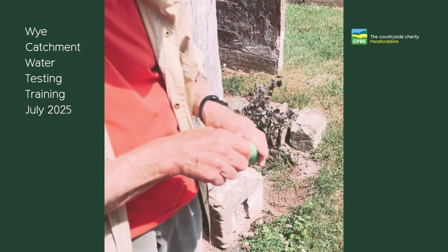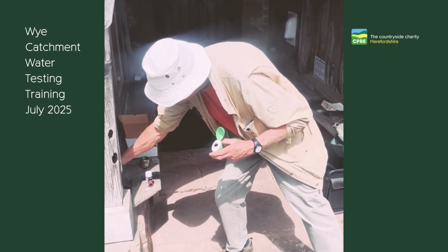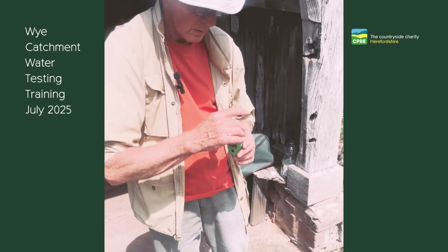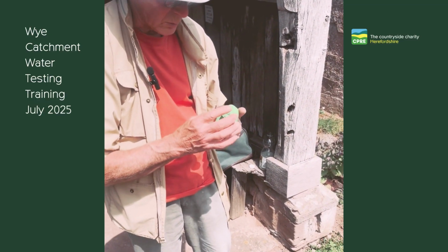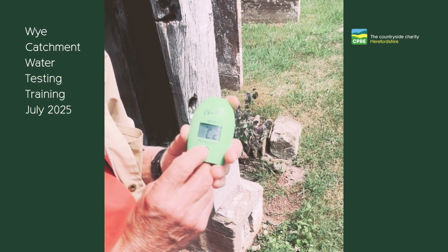So we take out cuvette number 1, like so, and put in cuvette number 2. There's an important point here because it says add and press, but unlike with C1, we have to press and hold.